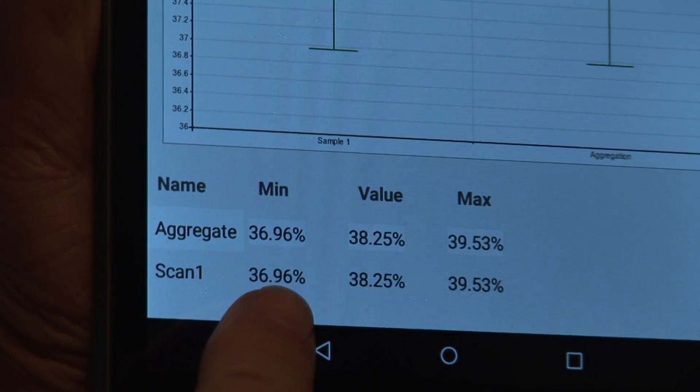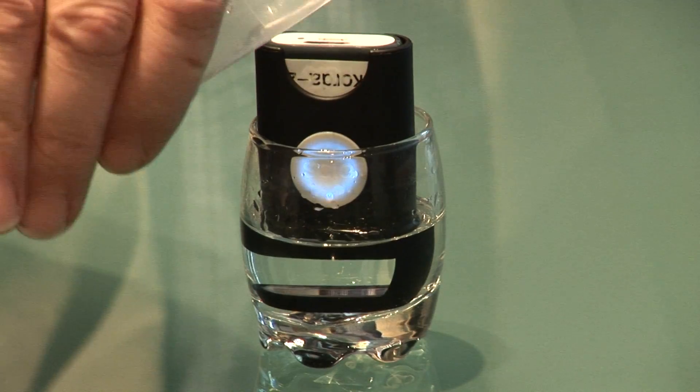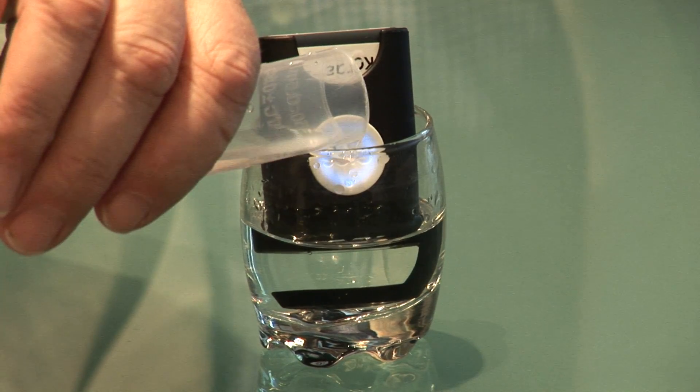You can see that it's between 36.96% and 39.53% alcohol — fantastic! Now let's add the water to the glass and run the test again.